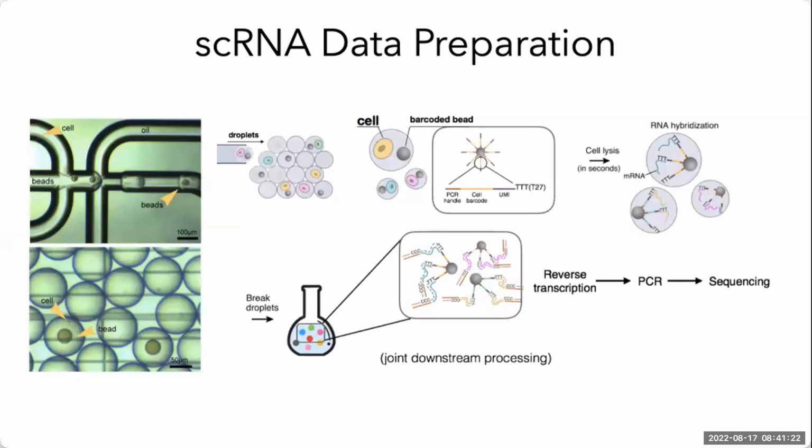So while choosing the technology that quantifies your mRNAs, you have to keep in mind the kind of analysis you want to do.